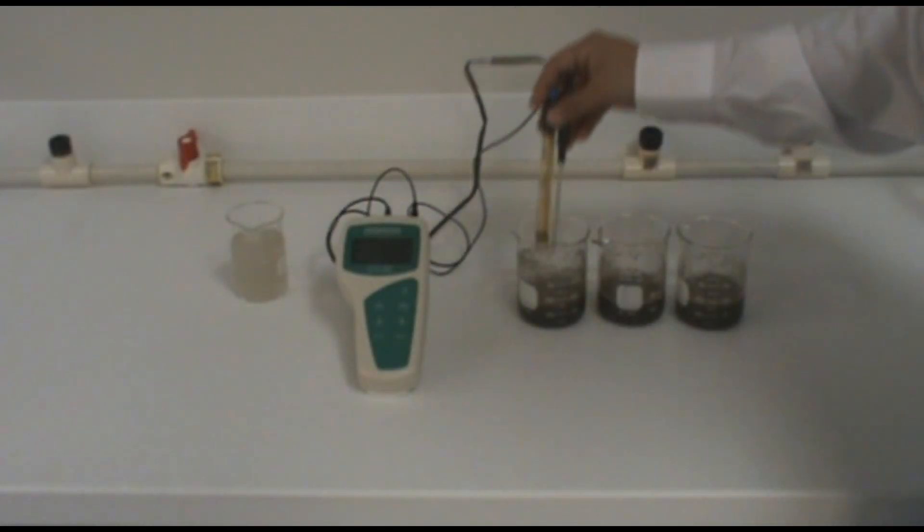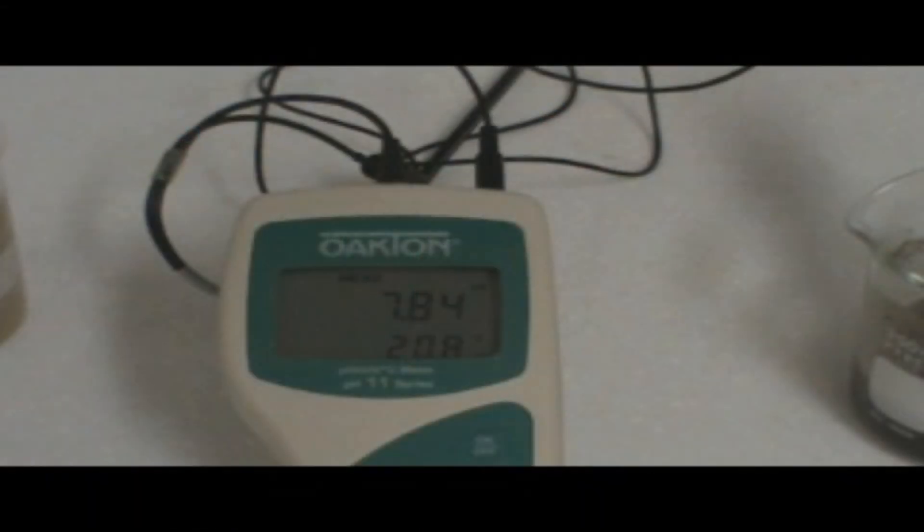After you have done this, you will then take the average of the three readings in order to get a value for the pH of your soil.